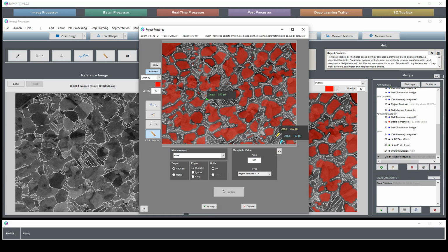Yeah, that's a little bit better to my eye. So now if we set 200. What's this one? 345, 210, 225. Again, you sort of have to do the best you can. You're never going to be absolutely perfect, but this looks pretty good.